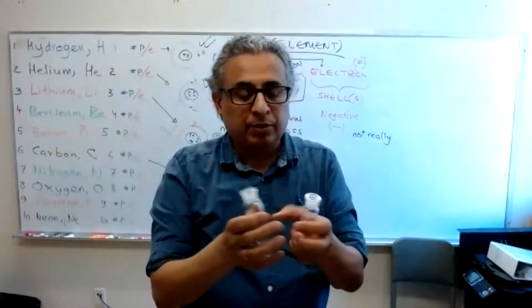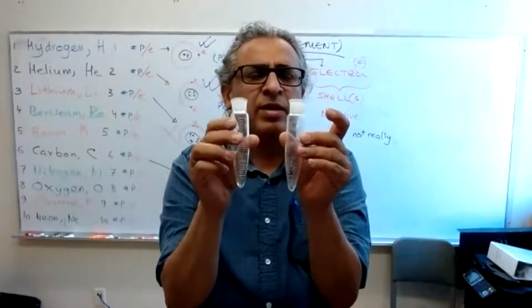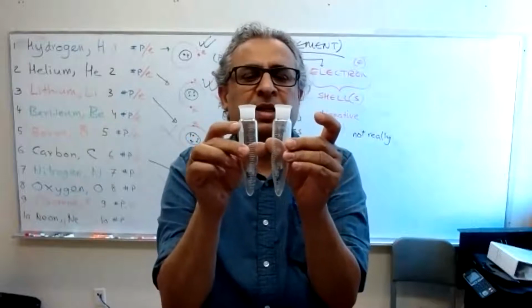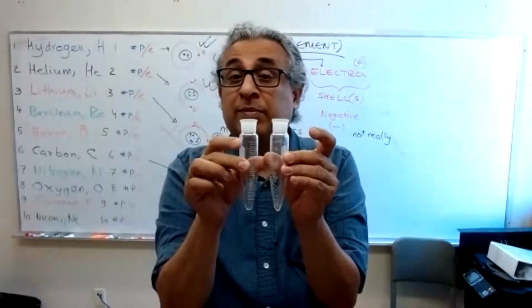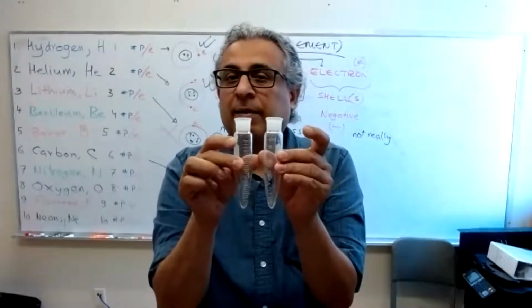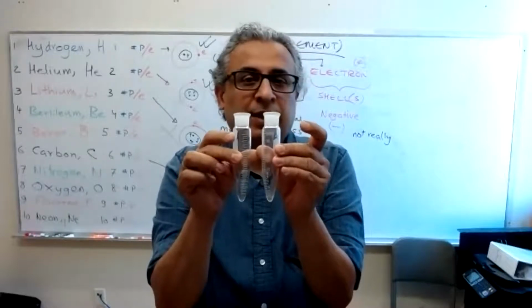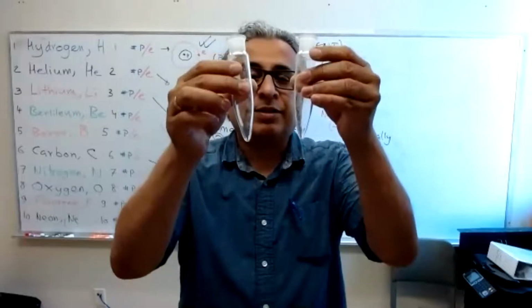They're pretty cheap too. Do you know what this is? Has anybody worked in a research or analytical lab? Anybody have any idea? And you always need two of them together to do something special. No? You use it in a centrifuge. We'll discuss it later on. These are called centrifuge tubes.